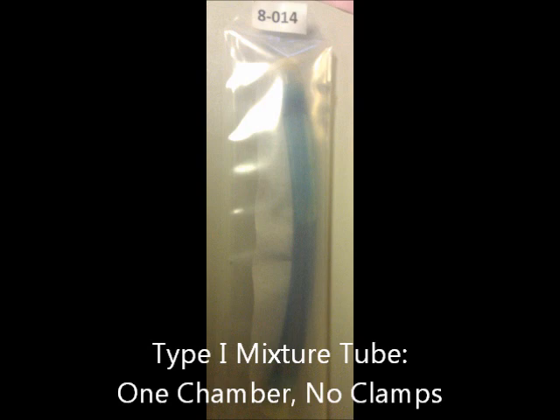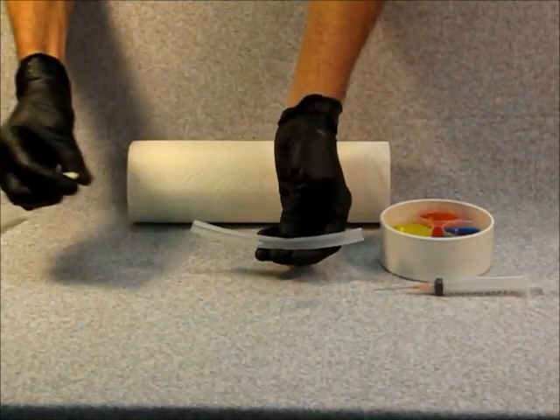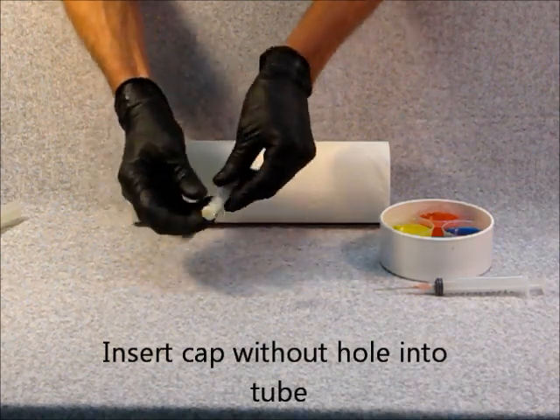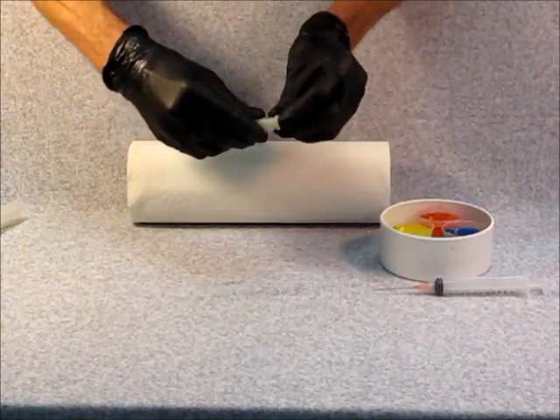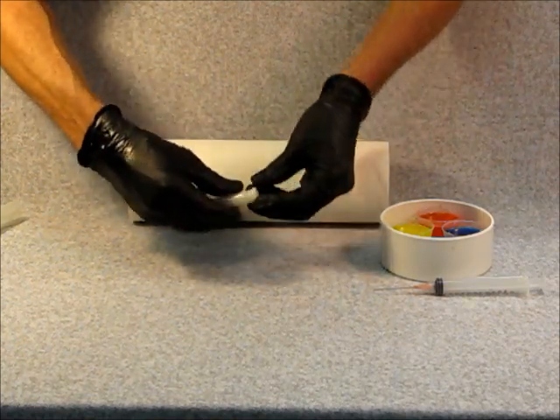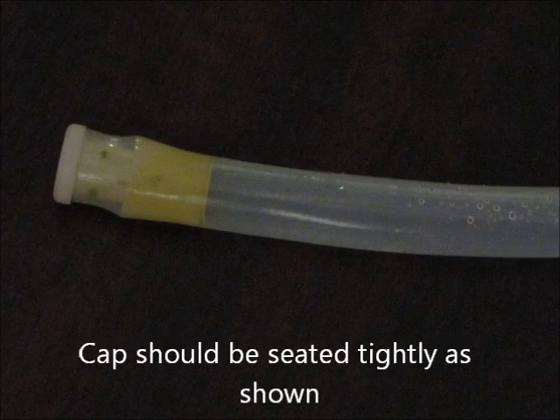A type 1 mixture tube has one chamber and no clamps, so there is no crew interaction. To begin making the tube, insert the cap without a hole into the end of the tube. The cap should be seated tightly as shown here.